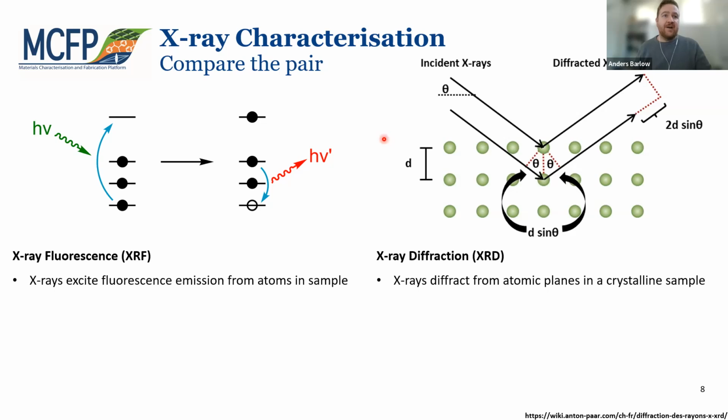For Xray diffraction, we are diffracting these X-ray waves from the periodic lattice within your sample. So we have X-rays coming in through here. They will constructively interfere if the Bragg condition is met. So when these X-ray light scatters from the periodic array in your crystal, we'll get constructive interference when this 2d sine theta condition is met.